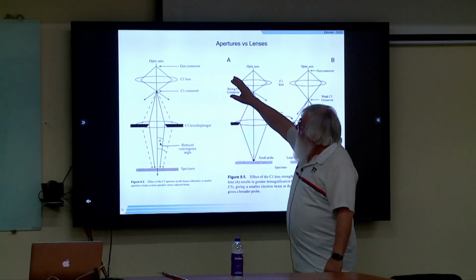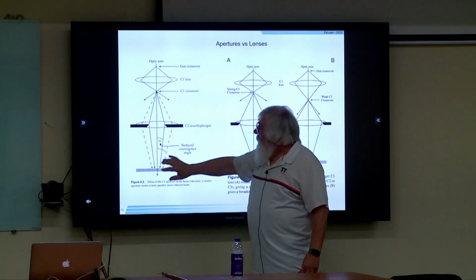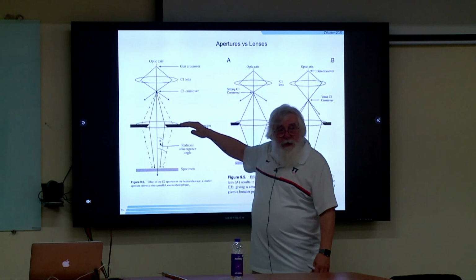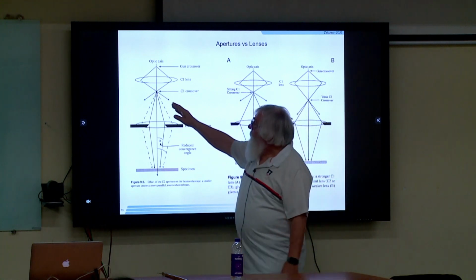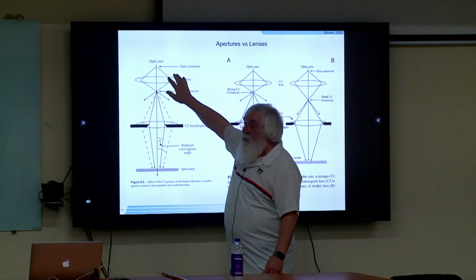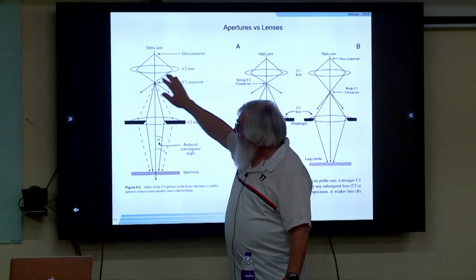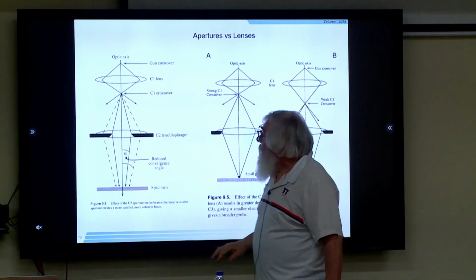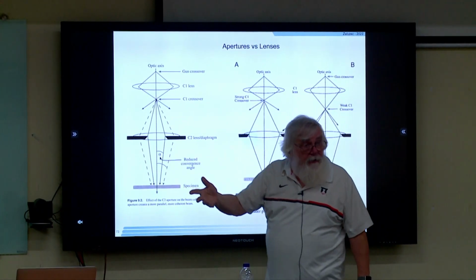So we talked about how lenses take the beam and bring it down. What we haven't talked about is the fact that in addition to lenses, we also have apertures in the column. And the apertures provide several functions. First of all, they get rid of very high angle scattered electrons. Even though we have a lens, we don't focus everything down. So some of these electrons come off at wide angles. We really don't want that coming down the column. So the role of apertures is to restrict the beam. Because the apertures cut off some of the beam, they also control the beam current.